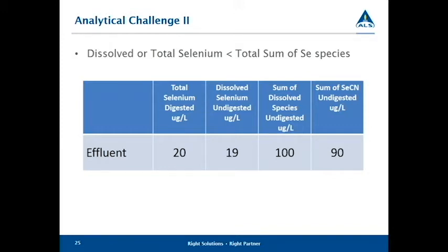Sometimes you get a red precipitate, which is one of the allotropes of selenium, and sometimes you may get a black precipitate. The other problem is that the metal you've just formed will actually coat the bottle, and therefore when you take your aliquot for total metals analysis, it doesn't take any of that material that's absorbed to the container walls. So it plates the walls, and you can see it visually. If you take a selenocyanate sample and add acid to it, you can see how this sticks to the container walls, and therefore isn't incorporated in the aliquot that you take for analysis.